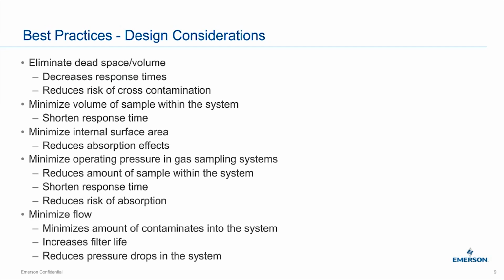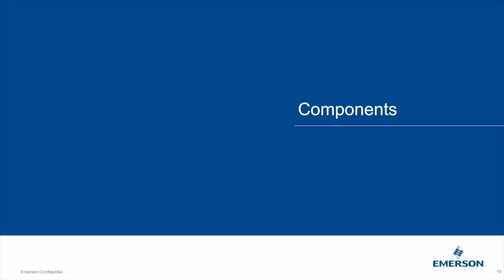Okay, hi everybody, it's Shane here. I just got a couple of questions that were asked through the Q&A interface, and they relate to the H2S and the Silco coating for the stainless steel, the Silco-coated tubing that we use for H2S.